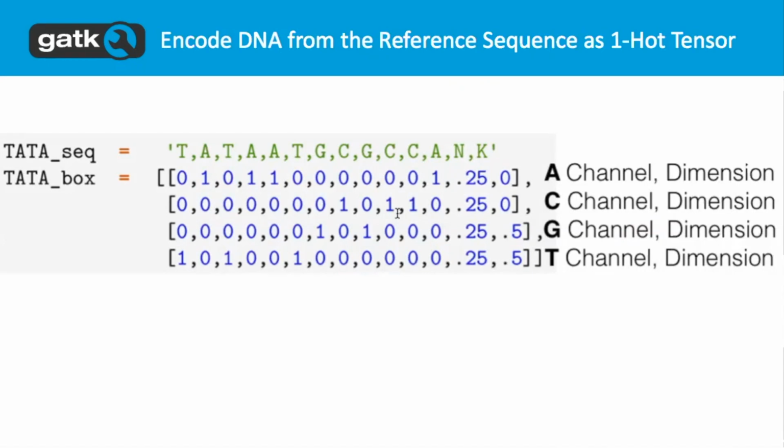So, okay, now we have the motivation for why we want to look at the sequence context. Now let's find a way to represent it so that we can take advantage of all the convolutional neural network research to apply it.